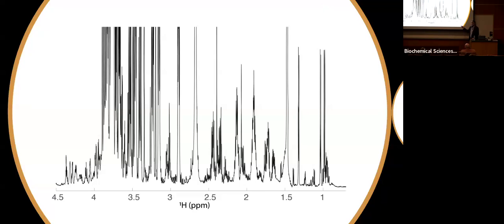But some of these you wouldn't be confident to interpret directly from the spectrum. They look like they could be noise or artifacts, but I'm here to tell you that they're not. And there are a lot of mixtures in here. So the problem that we face in NMR metabolomics is that we have to figure out what is in here. We do a lot of 2D NMR, which helps quite a bit in annotation and identification, but a lot of people work directly from 1D proton NMR spectra. And I think it's a little bit risky if you do that without some additional measures.